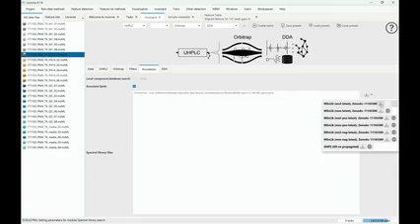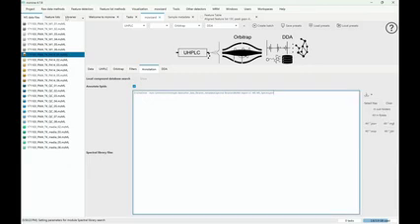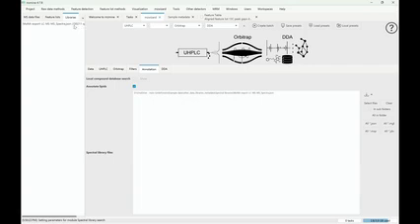You just click on download, and it's going to download either the MS2 spectra only, the MSN trees, positive, negative. There's some options here, and then you can use a much wider array of libraries. This library was kind of small, with like 150,000 spectra, and of course much fewer compounds. But we're also going to see with MSNlib, we already have many more compounds. So you're going to have a few more annotations.